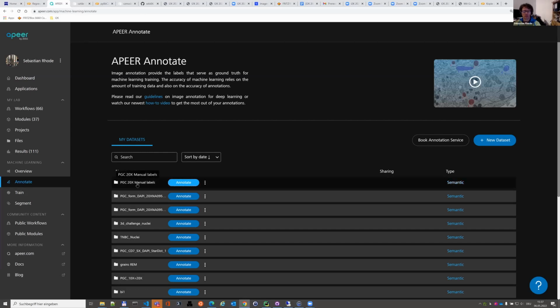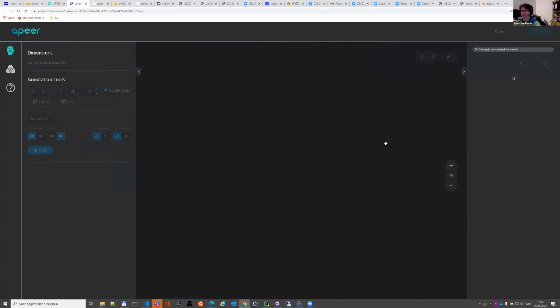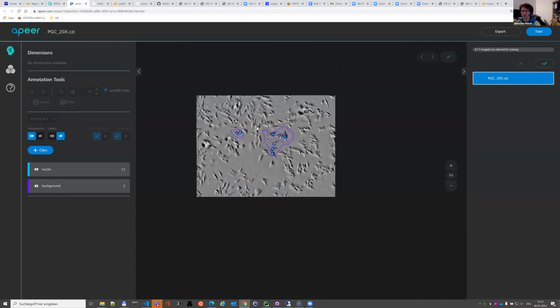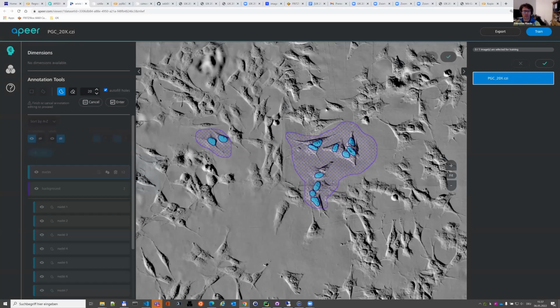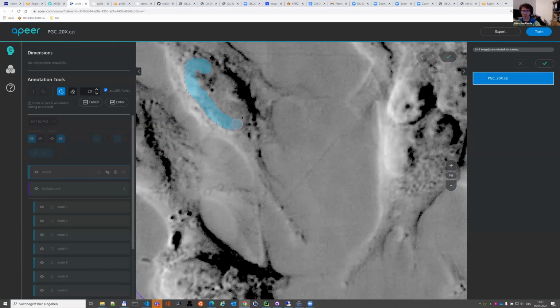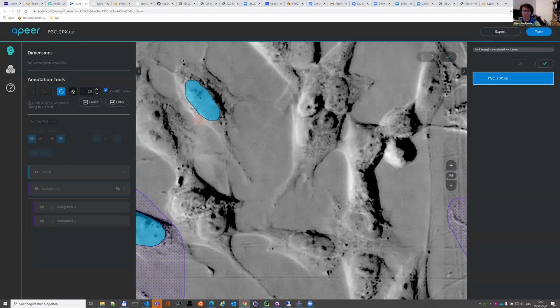All you have to do is basically do something like this. I go back, I can also upload some data, go to the annotation viewer. Here you see an image. You can have more than one image. You can define some classes, and you can do what you can do in most of those softwares. Here you can label some structures and say this is a cell nucleus, and you can label here some background. And the cool thing on arivis is labeling is very simple.